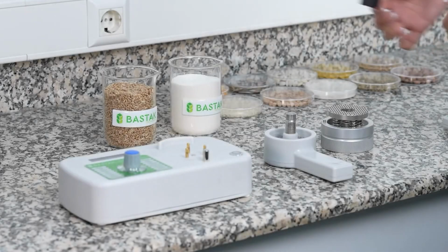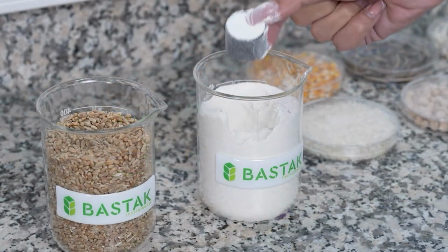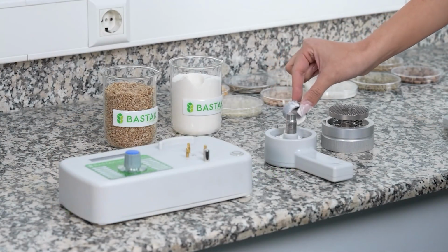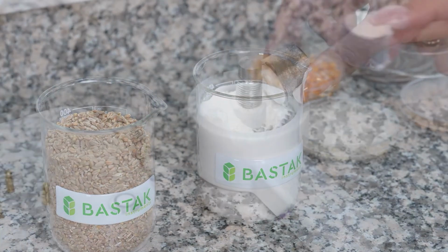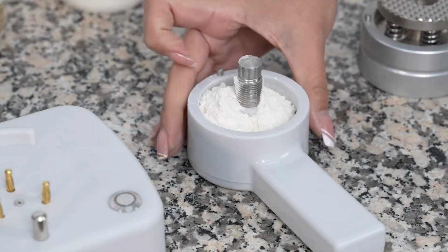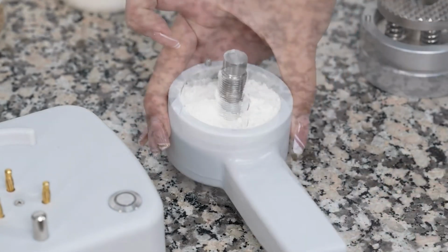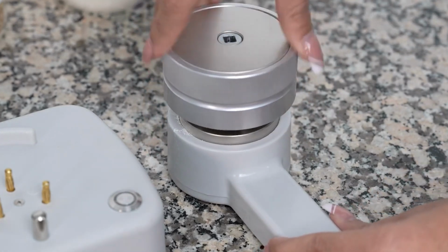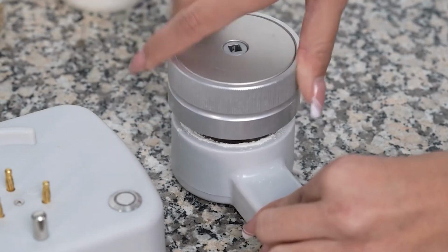To perform sample analysis on powdered products, 2 scale samples are taken using a sample transfer container and poured into the sample chamber. To ensure the sample is spread evenly, the sample chamber is gently shaken. Once the sample is observed to be completely spread, the upper crushing unit is taken and placed onto the sample chamber screw, tightened manually as much as possible.